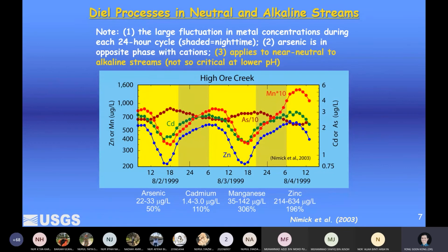Maybe yes, maybe no. Because, like I told you, there's no right or wrong. It's just whether the sample represents the conditions that you want to sample, and does it answer your objective. Maybe the monitoring plan specifically says they want to find out the metal concentration in the afternoon. So afternoon, yeah, very low.